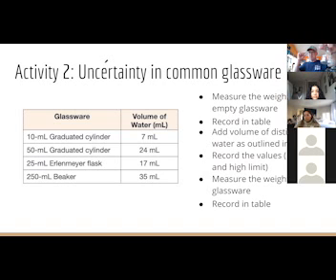But then it's basically, how accurate do you think you can get? What's the lowest volume you think is possible, and what's the highest volume you think is possible? That's more or less up to you, based on how accurately you can determine it.